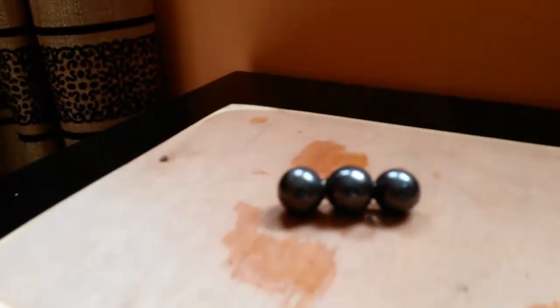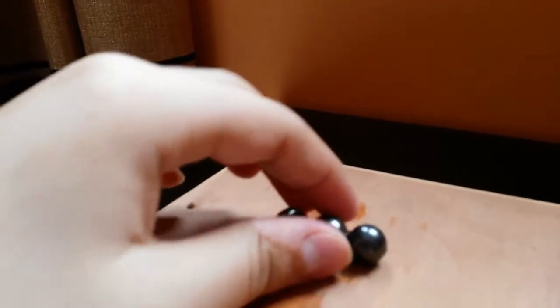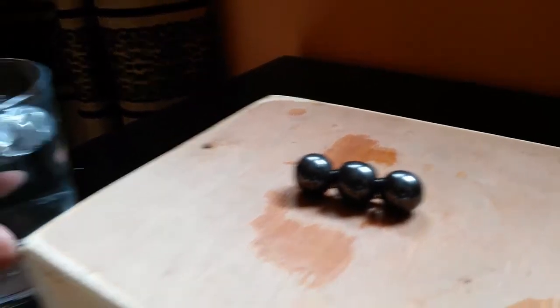For the stirrer, I'll be using three small ball magnets because I don't have a traditional stirrer bar — these are an alternative. They also provide an added bonus as they are magnetic, so they increase the bond between the main magnet and the stirrer.